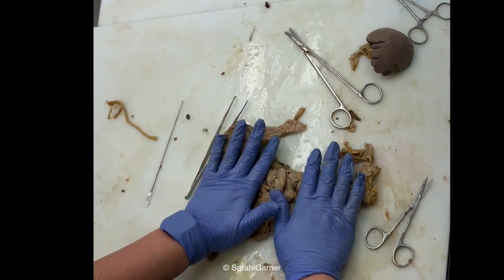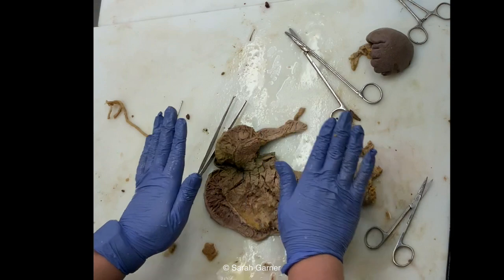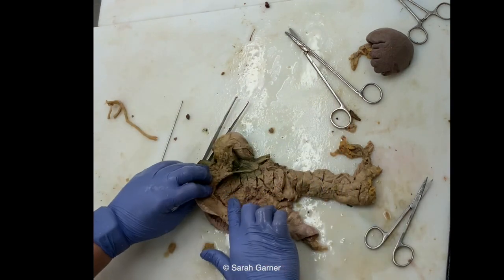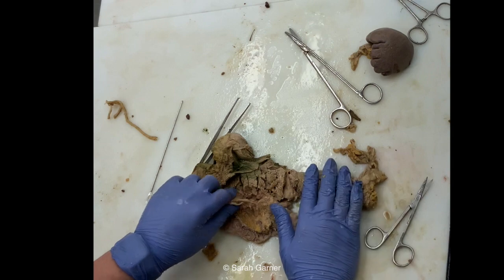There are a bunch of different ways to do this specific part of the sectioning at autopsy. The main takeaway is that you want to make sure you're examining everything. So no matter how you're doing it, make sure you're opening the whole length of the bowel, and you're opening up and sectioning through the pancreas thoroughly. Also make sure you're checking the lumen of the splenic vessels.